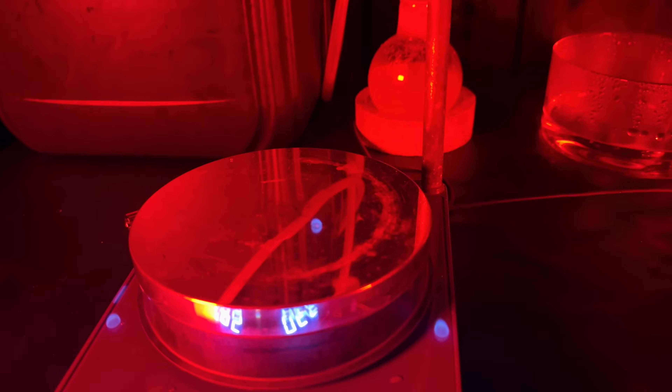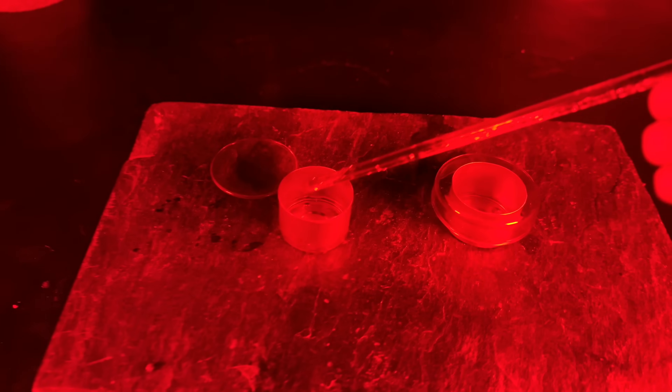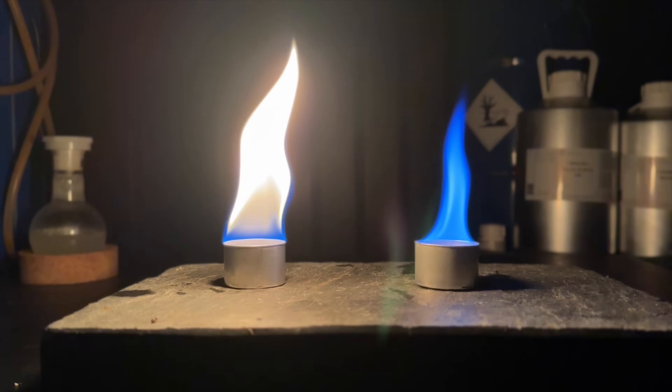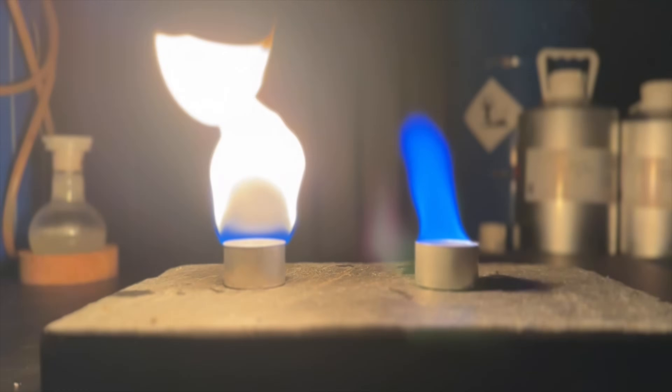Before this demonstration, I tried to ignite the carbon disulfide using a glass rod I heated in boiling hot water, but apparently it's too cold outside and this demonstration didn't work. Carbon disulfide on the right has an insanely blue flame, which I think is beautiful.